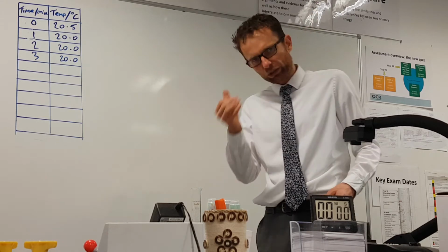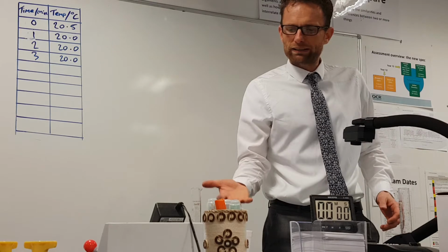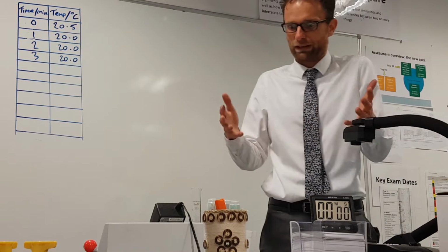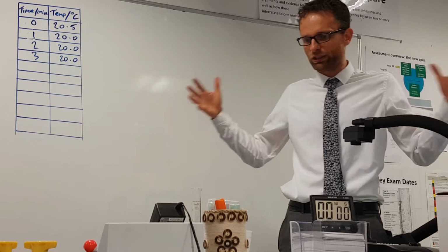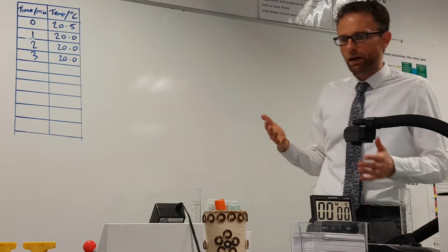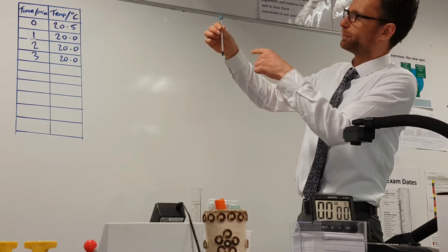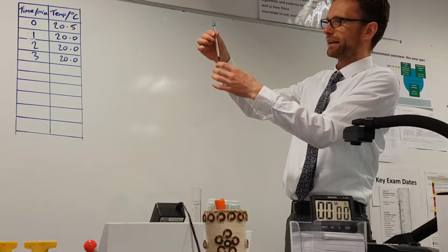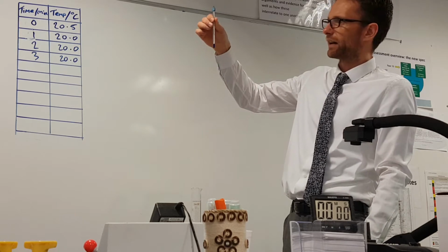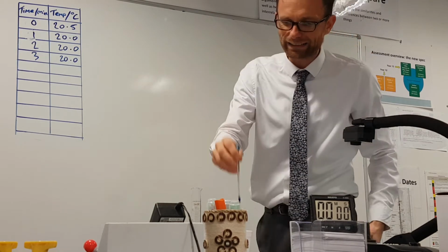Now, the reason we use this cooling curve technique is that when we add the reagent, the temperature of the solution, which is the surroundings, to which the energy is being supplied, jumps up very quickly. But it takes time for that increase in temperature to be registered on the thermometer. The extra energy has got to be conducted through the glass of the thermometer. It's got to heat up the spirit inside, that's got to expand, and it takes quite a while.